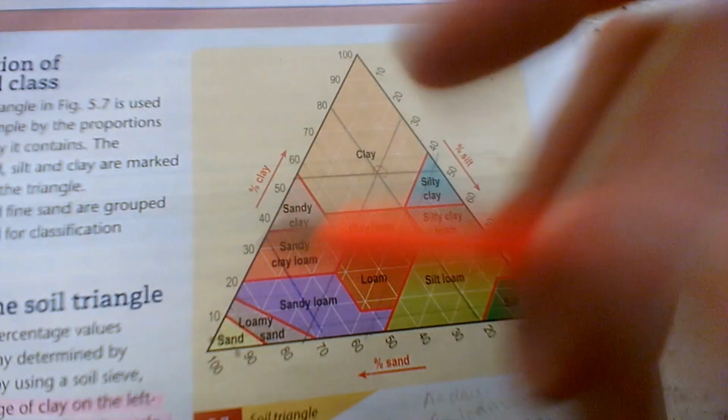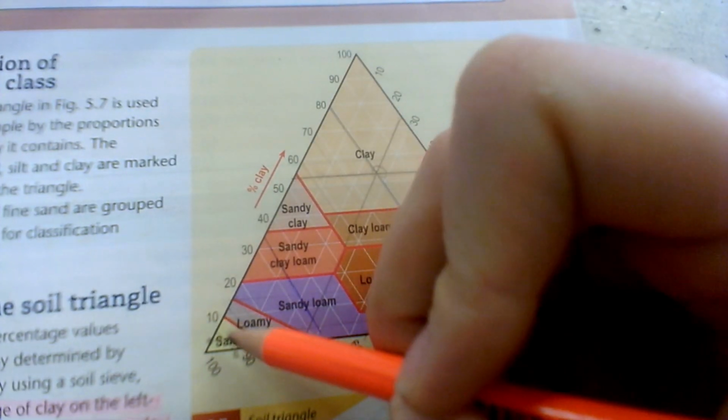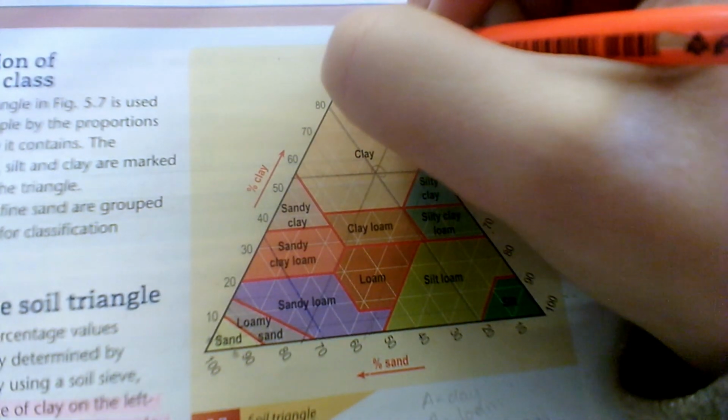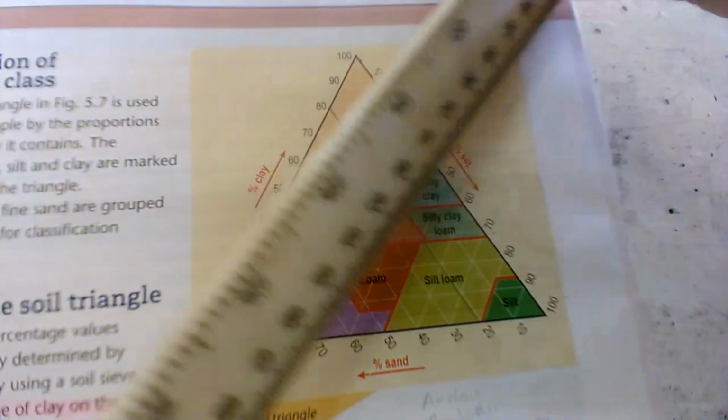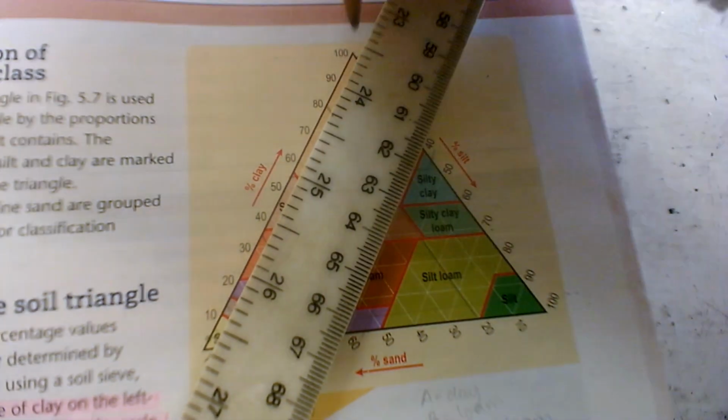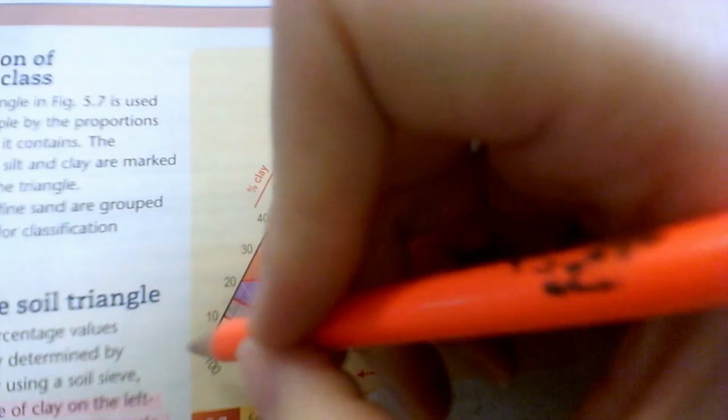So you can see 2 of them are already crossing in sand. Then you just do the third one to double check. So it will be 1% up here. And then I'm going to bring it down here to this, and they should all intersect in the one area. So it's all intersected here.